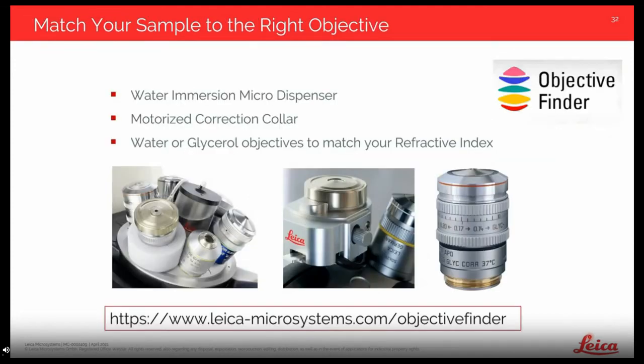One of the biggest choices any researcher needs to make when doing microscopy is to choose the correct objectives. At Leica Microsystems, we have many different objectives to choose from. We have water immersion with a microdispenser for long-term imaging, and motorized correction collars for doing multiphoton. We even have water or glycerol objectives to match refractive indices of your samples. We also have ones that go up to BABB and other types of clearing methods.